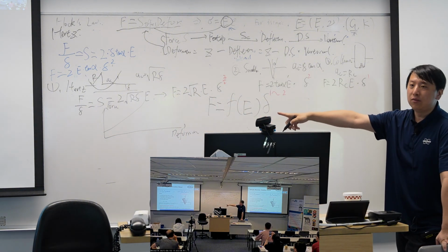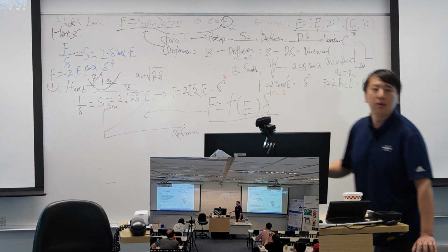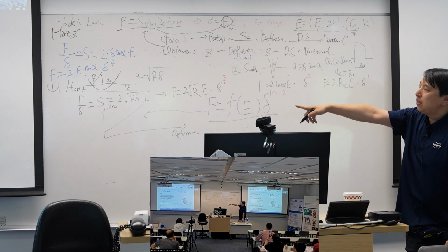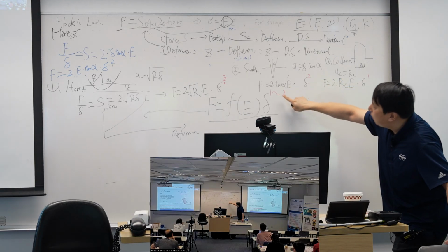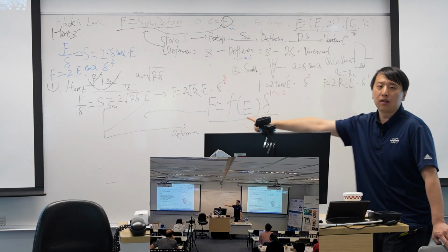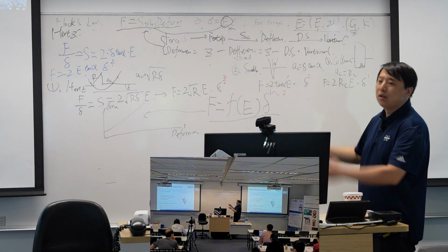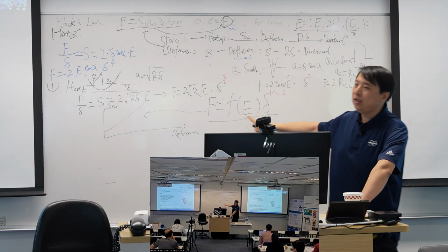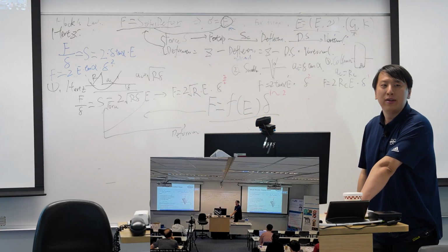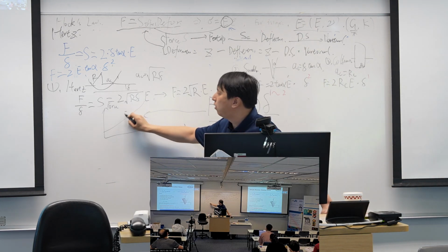And from this curve, they will use this model to fit the curve. And from the fitted function, he can define the order and the coefficient. And then from this, he can finally define what the probe looks like. And the coefficient is a function of modulus. So from that, he can get the modulus out.